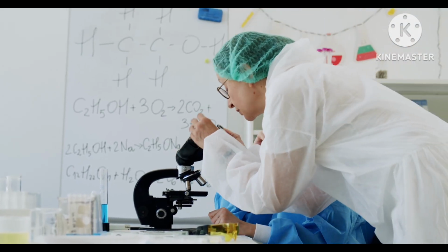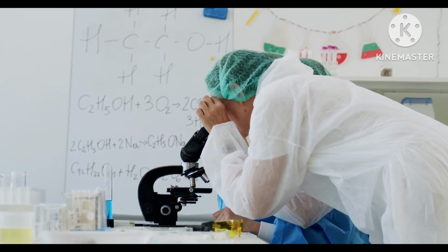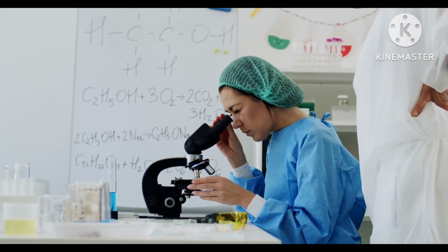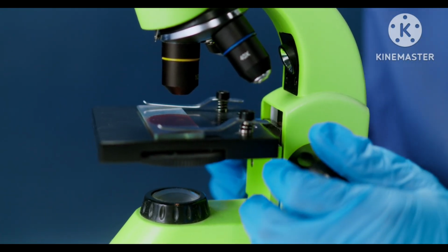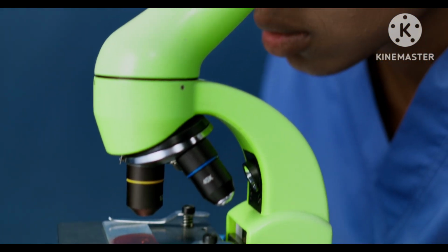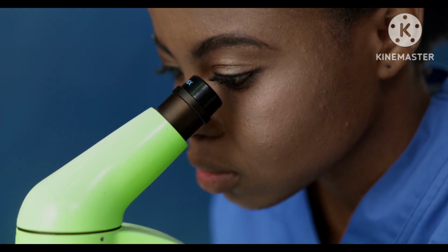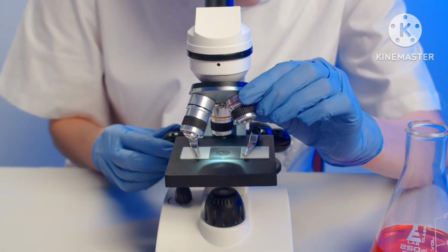Before we end, let's revise today's topic quickly. Today we learned a microscope is an instrument that helps us see tiny objects clearly by magnifying them. It is needed because many medically important structures like blood cells, bacteria, and parasites are too small to be seen with the naked eye. It is used in hematology, microbiology, urine, and stool examination. For MLT students, the microscope is a basic and essential laboratory instrument.